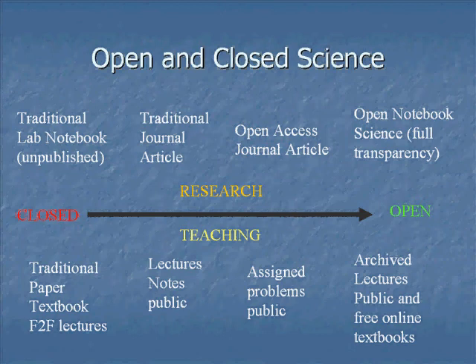Recently, open access has become pretty popular, and the advantage of that is that people don't have to pay to access the articles. But the format of the articles is still the same as the traditional journal. So when we talk about open notebook science, we're talking about making the actual laboratory notebook and all associated processes completely open in real time, or as close to real time as we possibly can get.